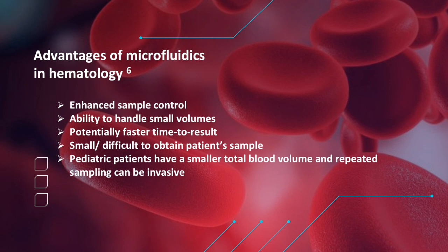The advantages of using microfluidics in hematology include enhanced sample control, the ability to handle small volumes, potentially faster time to results, analyzing small or difficult to obtain patient samples, especially with pediatric patients that already have a smaller total blood volume and repeated sampling can be invasive.